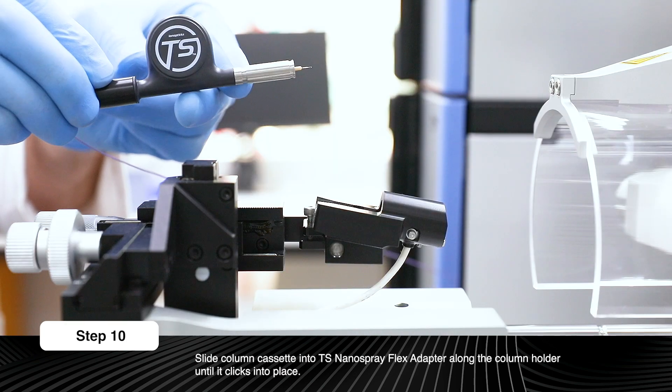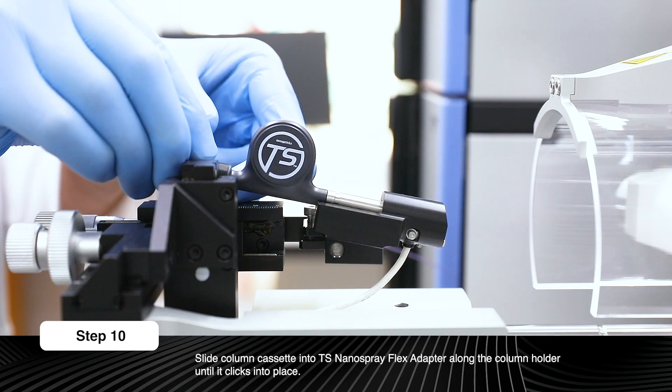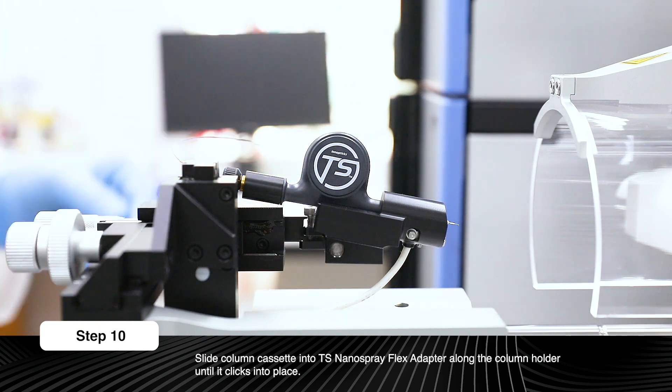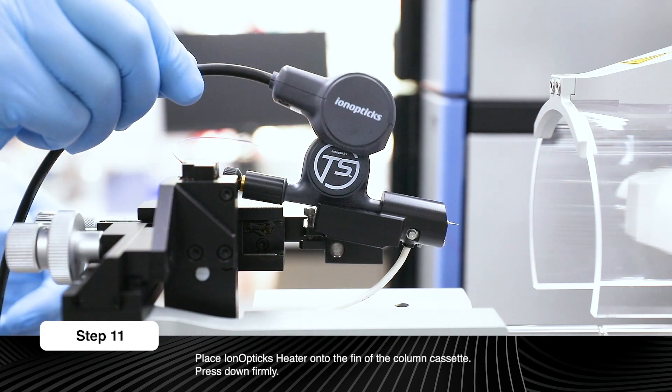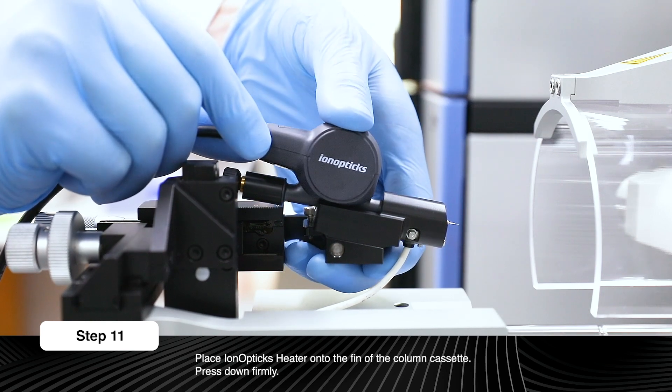Slide the column cassette into the TS Nanospray Flex adapter along the column holder until it clicks into place. Place the IonOpticks heater onto the fin of the column cassette and press down firmly to ensure that the heater is held in position.